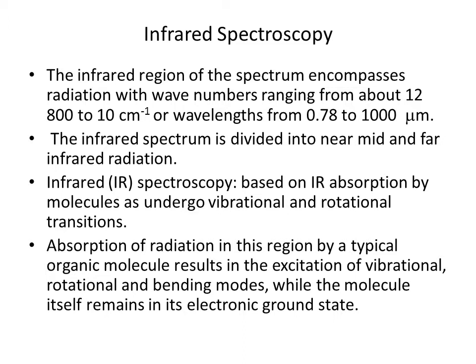The infrared spectrum is divided into near, mid, and far infrared radiation. Infrared spectroscopy is based on IR absorption by molecules as they undergo vibrational and rotational transitions. That is, if the molecule absorbs IR, then it will undergo vibrational and rotational transitions.